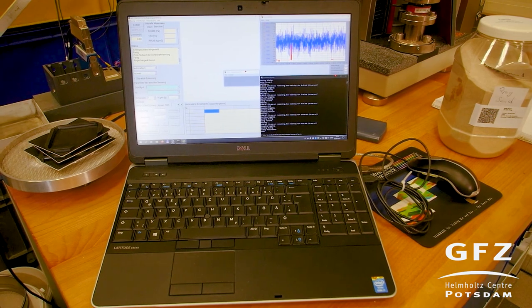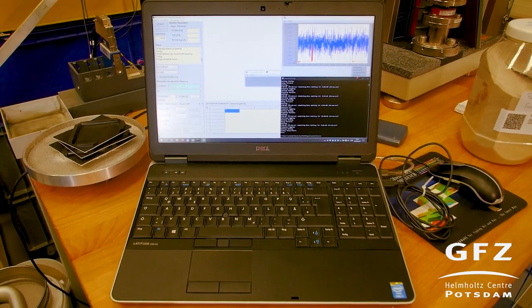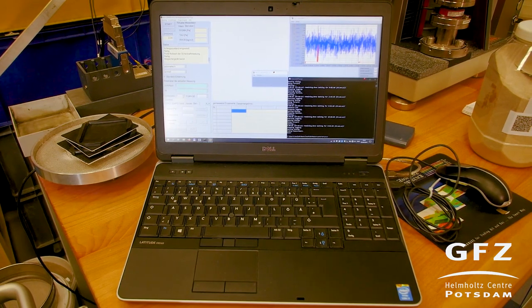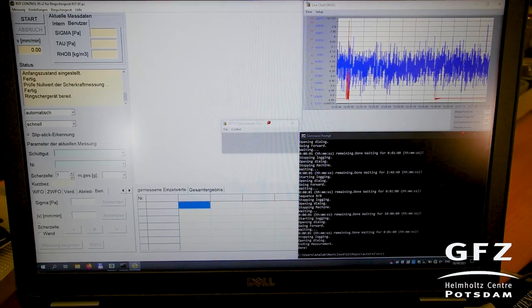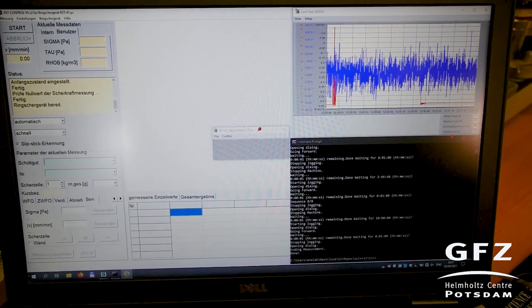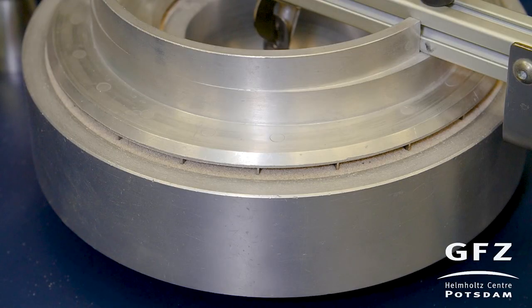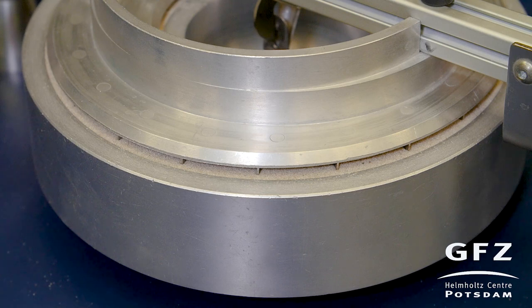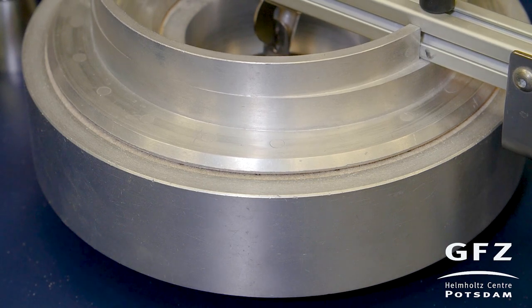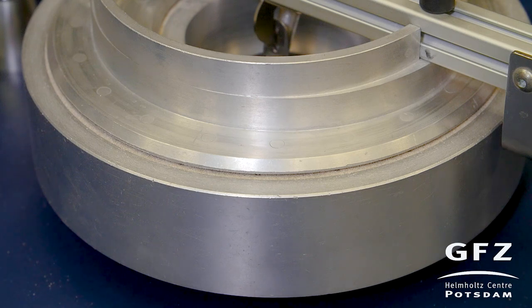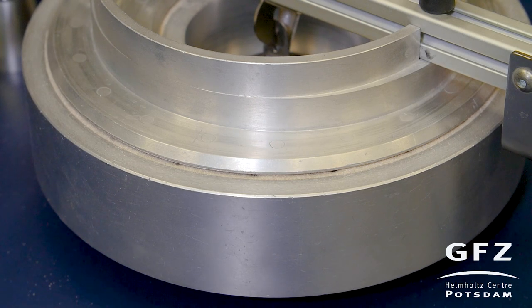To start the measurement I'm using a custom Python script which I will also provide, and this automatically controls the ringshear tester software which then controls the ringshear tester. I use these scripts to ensure constant timing and exactly the same parameters for each experiment. The script automatically enters the file name and other settings. Now it applies the normal load — you can see the lid going down. It will drive to 1000 Pascal and start shearing. Now the pre-shear is started and the cell is moved at 30 millimeters per minute.